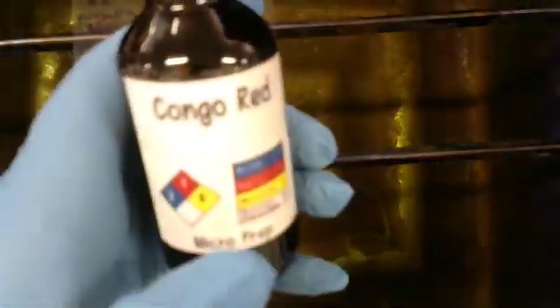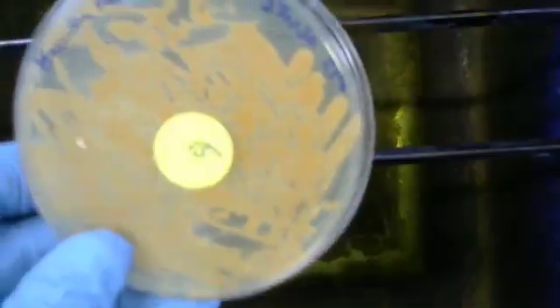And as I said, we're going to have two different types of stains. Our first one is going to be Congo Red. And our second, Nigrosin. We are also going to have two different bacteria. The first one, Kocuria rosea. Second one, Bacillus megaterium. So, we have our labeled slides right here.